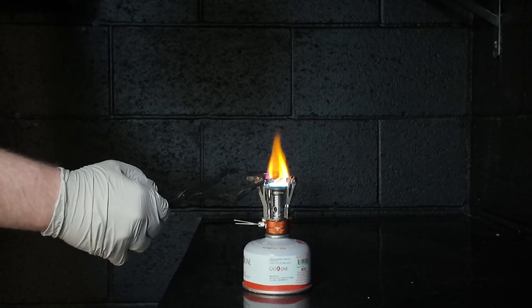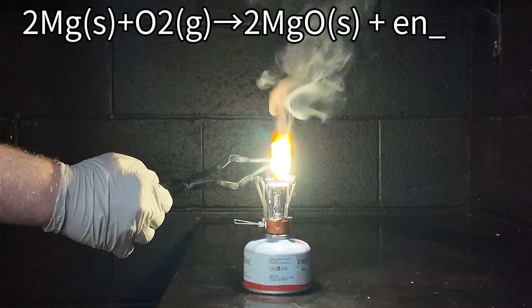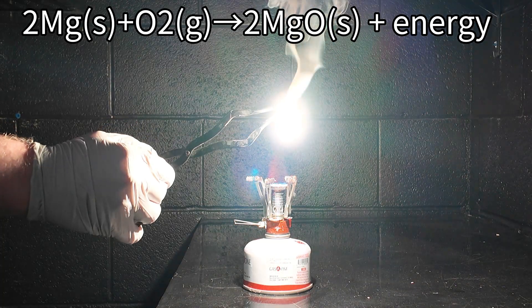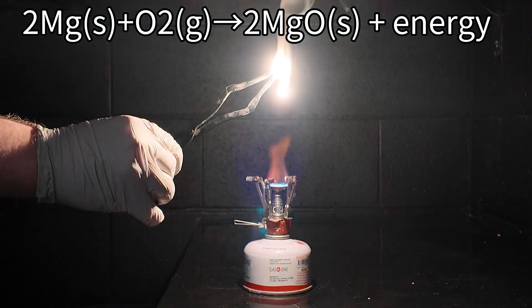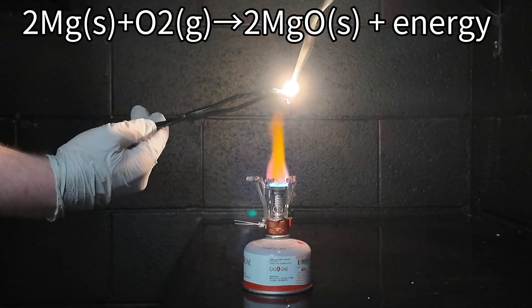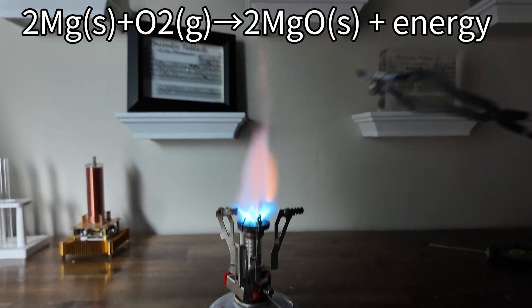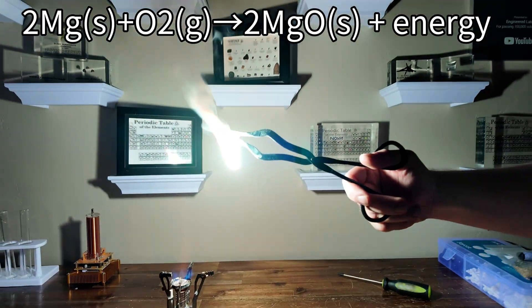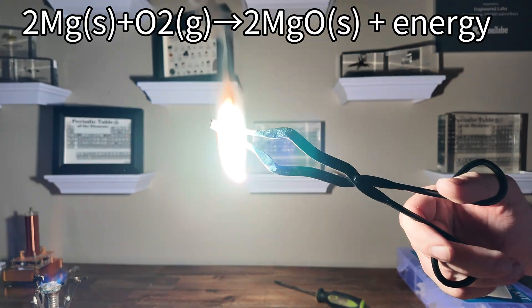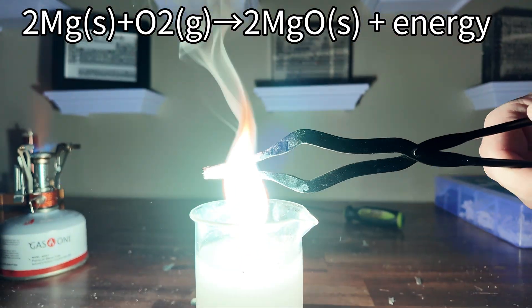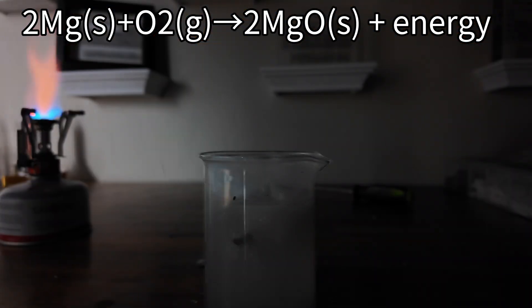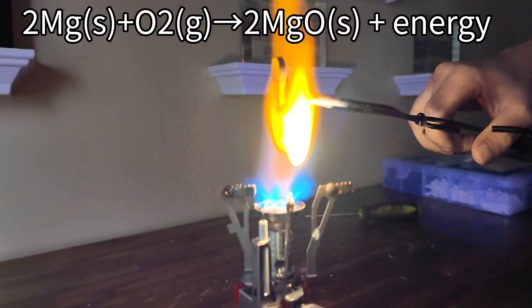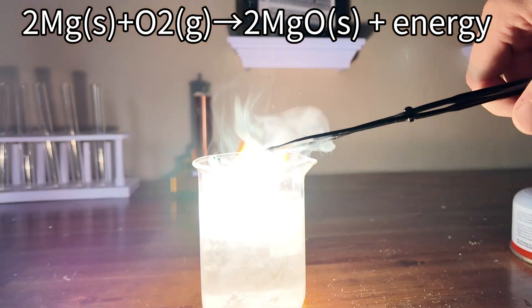So basically, what is happening in this reaction is the magnesium is burning and reacting with the oxygen in the air. As the reaction happens, it is an exothermic reaction. Exothermic just means that the reaction produces energy. It gives off energy. In this reaction, the magnesium reacts with the oxygen, and it bonds with the oxygen, creating magnesium oxide, but it also gives off energy. This energy is in the form of light, the photons that we see, and it's just blinding white, sun-like light.